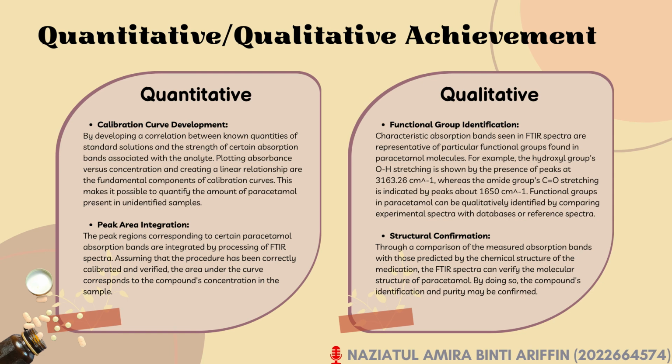Assuming that the procedure has been correctly calibrated and verified, the area under the curve corresponds to the compound's concentration in the sample. For qualitative analysis, we have functional group identification. Characteristic absorption bands seen in the FTIR spectra are representative of particular functional groups found in paracetamol molecules.